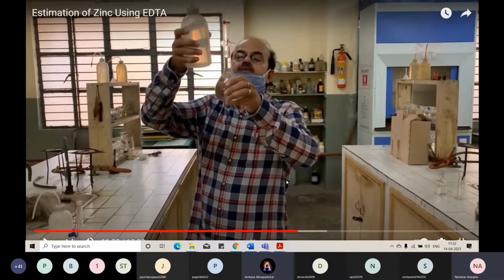What you see is a volumetric flask. So what happens when you perform this practical in your exam? आपका जो unknown sample है, there will be a liquid solution having unknown sample, जिसमें दोनों metals होंगे. आपको ऐसा flask दिया जाता है. Everyone will be given different flask.